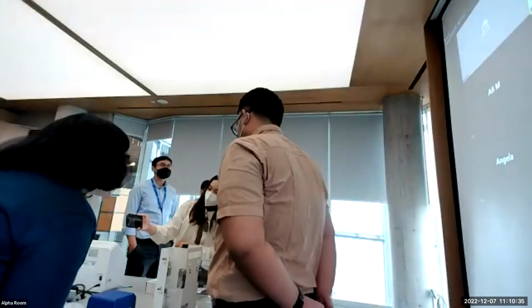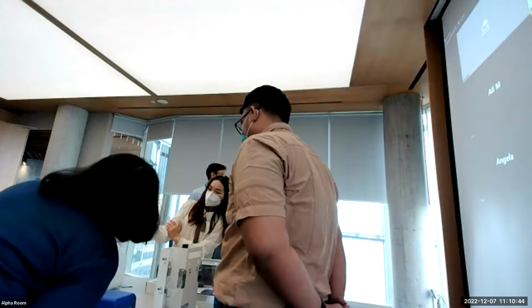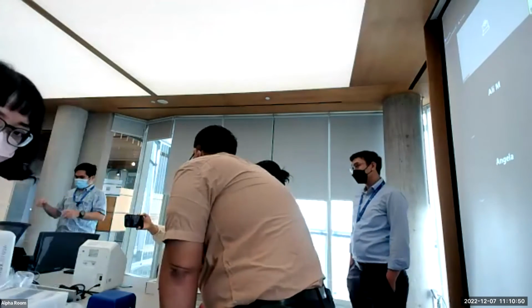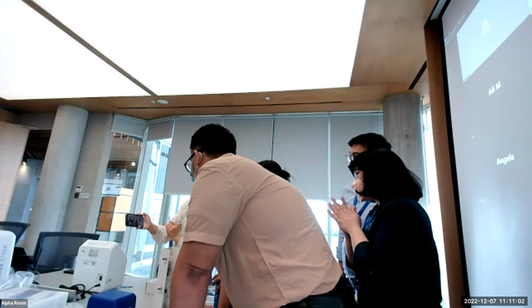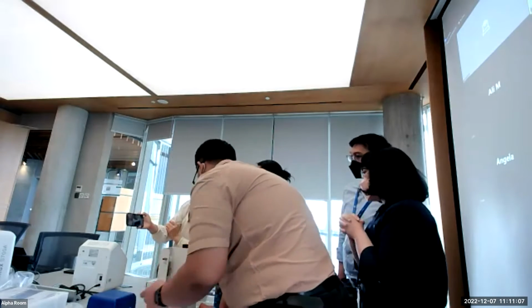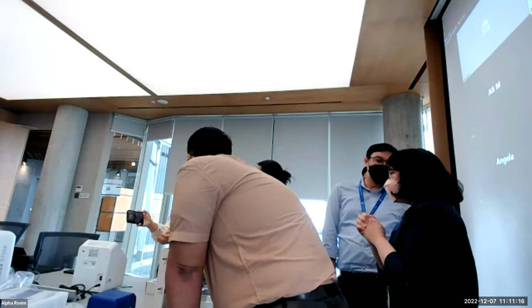And here is our ventilator. Here is a place for the air in, and if you want the animal to get the gas, you can connect this end with our anesthesia machine. The mask or the chamber are both okay. If you connect to the mask, you just put the toggle switch to the mask. To connect to the chamber, put it to the chamber. Both okay.